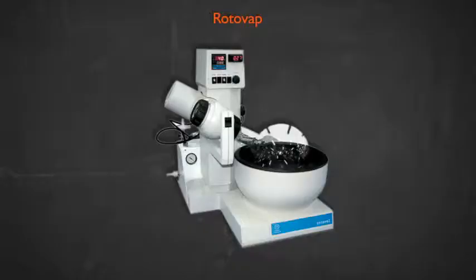You then attach it to the thing, and then there's a vacuum pump or some sort of pump to lower the pressure in this big container, and you simply lower it enough so that the most volatile components start to come off. At that point, of course, you have a gas which is rich in the volatile components and much less rich in the non-volatile components.